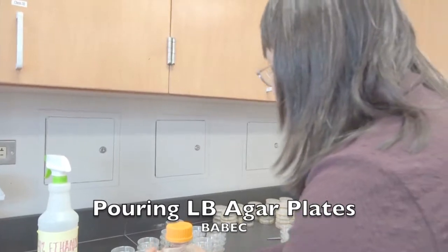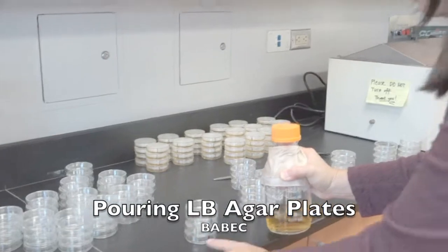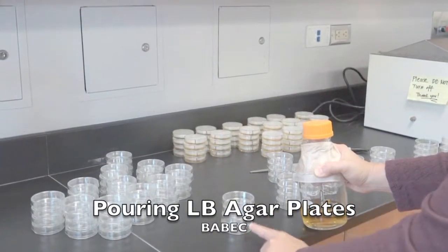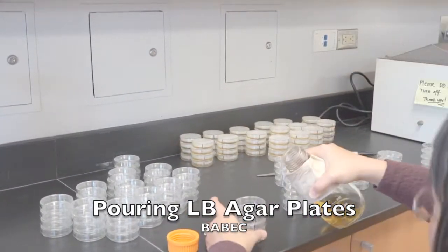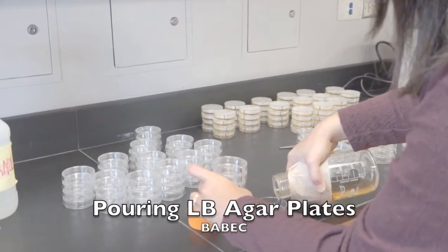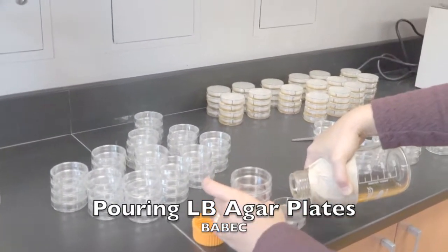What I'm going to do is take a stack of four and remove the last lid first, then work my way to the top. I just pour enough so it covers the bottom of the dish.